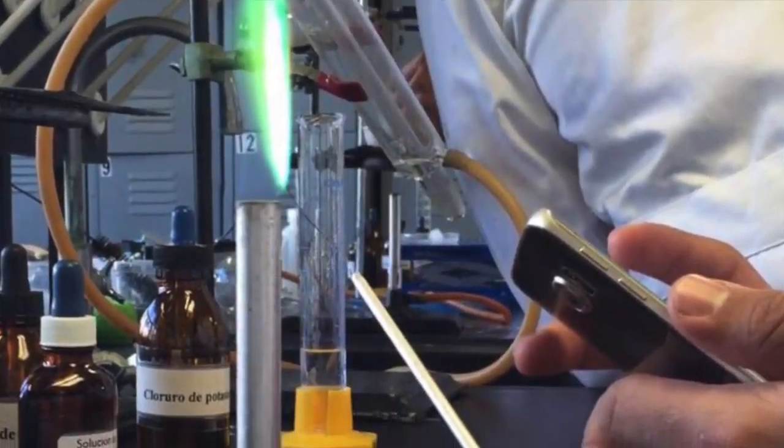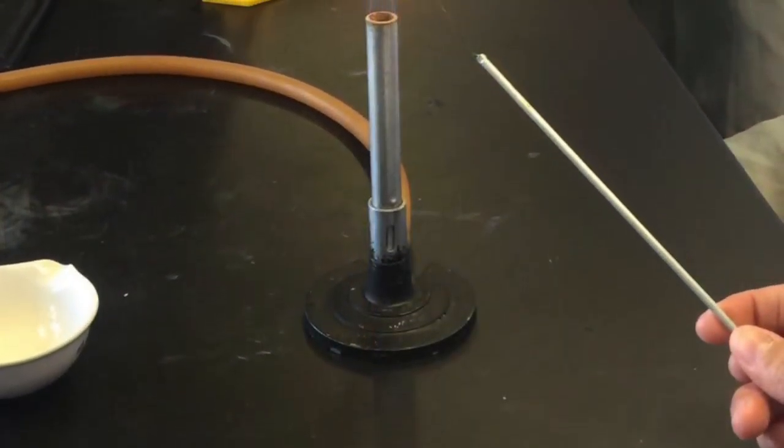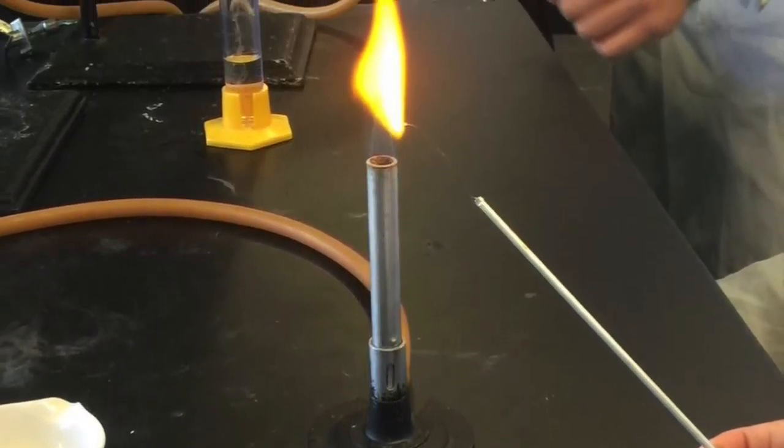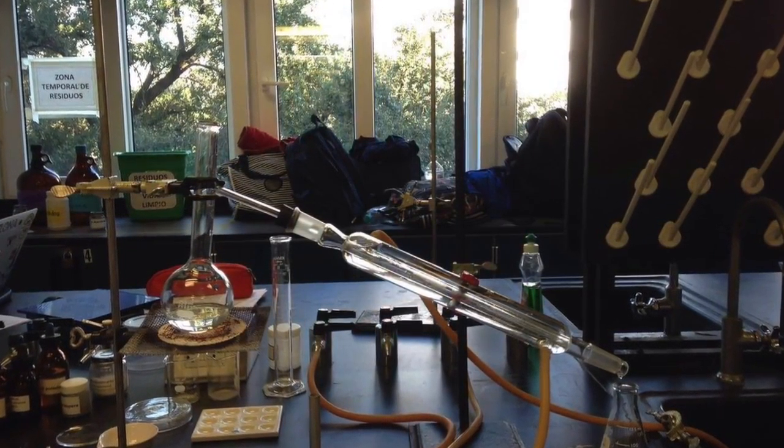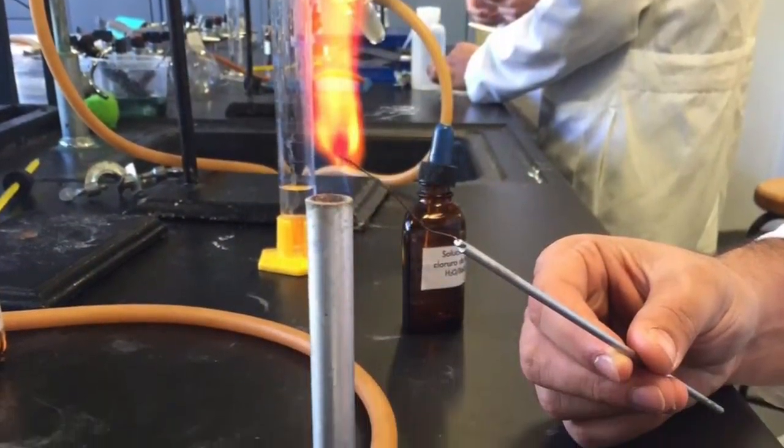We learned two important processes: distillation, that is separating a mixture of two liquids, where one changes to gas and then back again to liquid, and sublimation, that is separating two solids, where one changes to gas and then back again to solid. Also, we identified different cations with respect to their color.